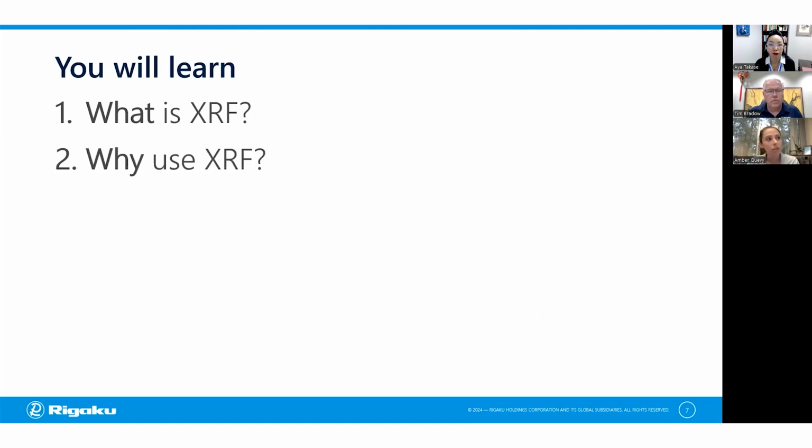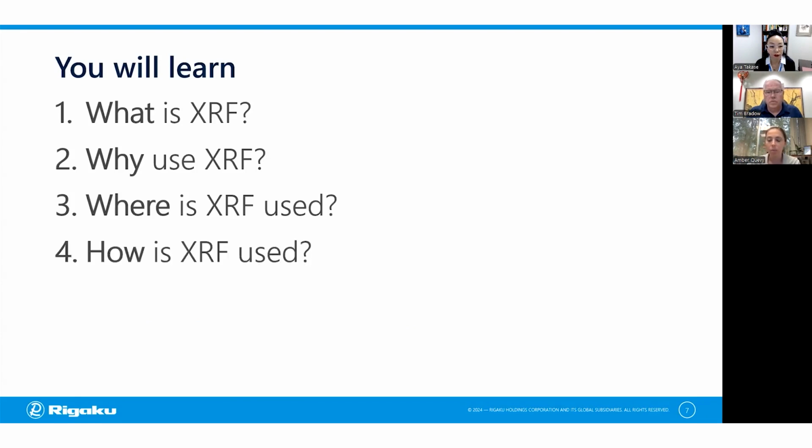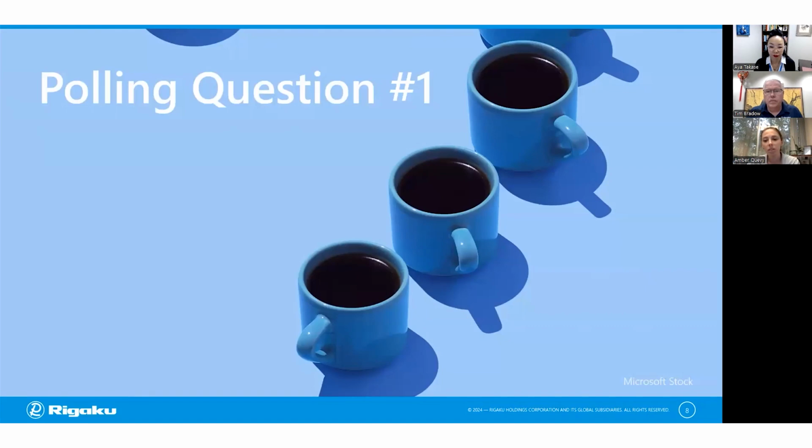Why use XRF? Like the technique suggests, this is a non-destructive technique, but there are some other reasons that XRF may be a good fit for your materials or lab. We'll also cover where in the battery process XRF can be used, and we'll wrap up with some examples of materials we've worked with. But before we get started, we'd like to get a feel for what techniques those in the audience use.